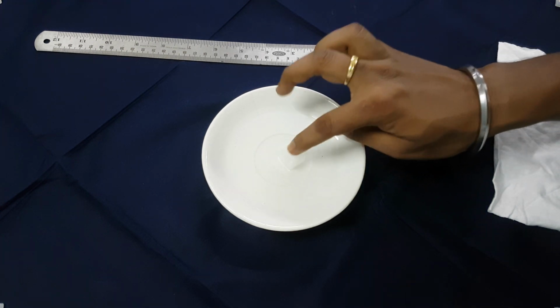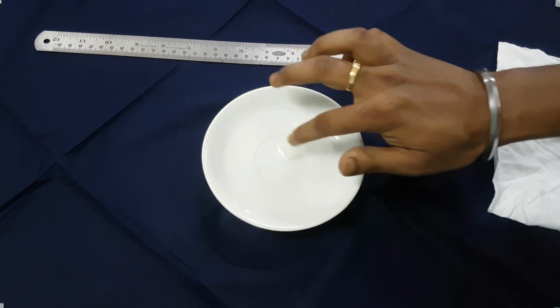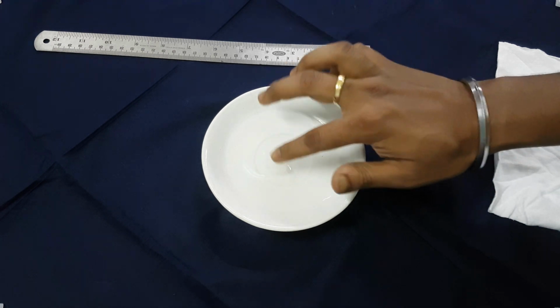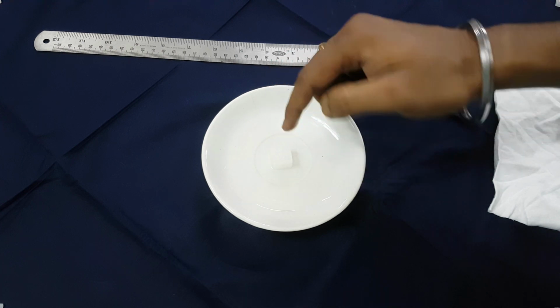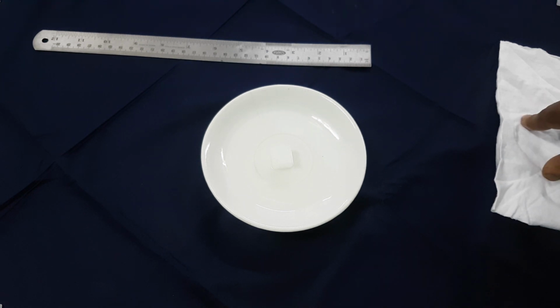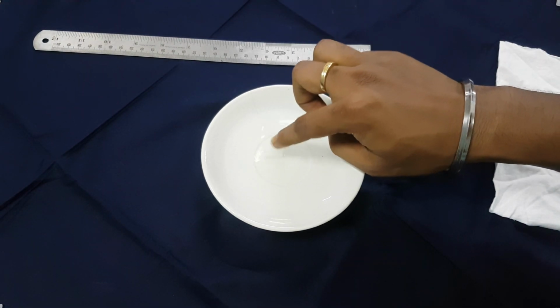So finally, after 4 minutes, I don't see any crumble, I don't see even a slight change in dimensions. Okay, I'll check the dimensions again. After this, I'll keep it over here to let the white cloth absorb the oil, and then I will keep it again back over here to take the final picture, so that we can finally conclude whether it is soluble even partially or not.